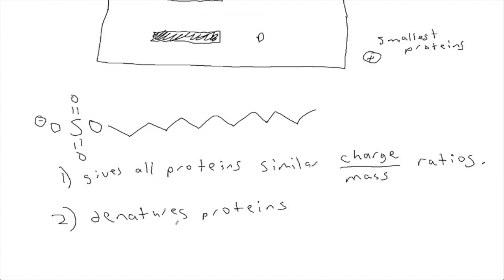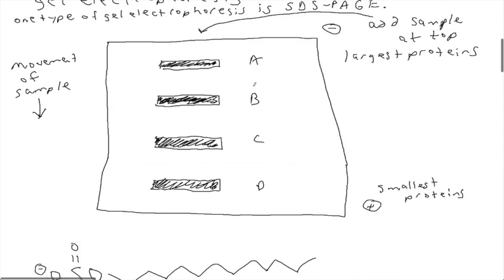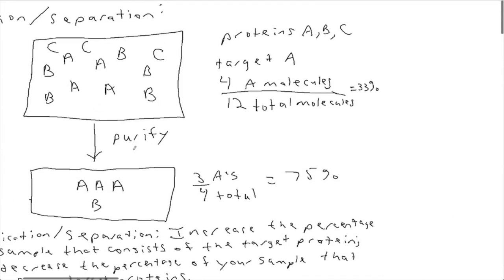So would that be breaking the primary, secondary, or tertiary structure? Primary. So you're saying that after you denature it, it'll be separate amino acids? No, it's just chopping them into pieces. So it's breaking them down, breaking into smaller pieces. Yeah. Okay, that actually turns out to be a misunderstanding. That actually turns out to be incorrect. So you had a pretty good understanding already of the electrophoresis, but this is an idea we need to take a detour and describe more carefully, because that's going to be important on your exam.